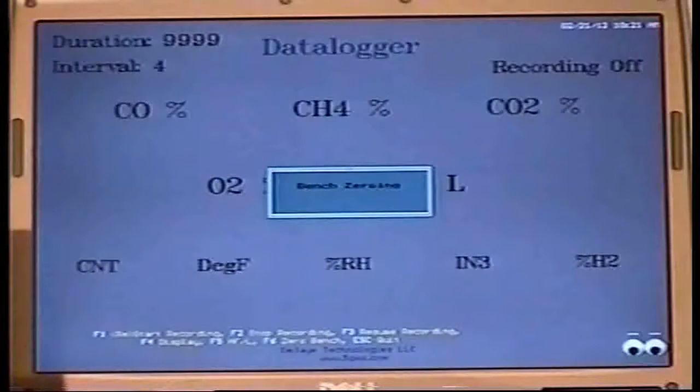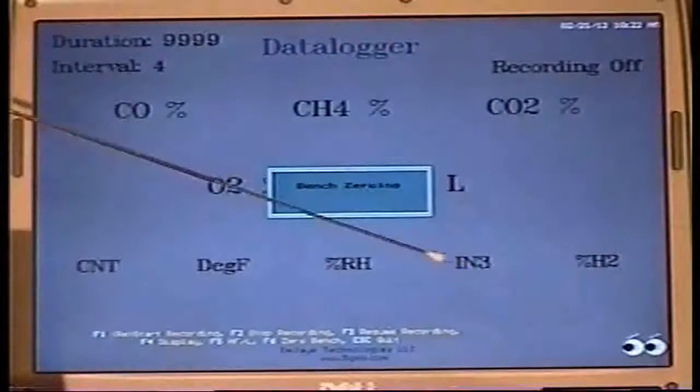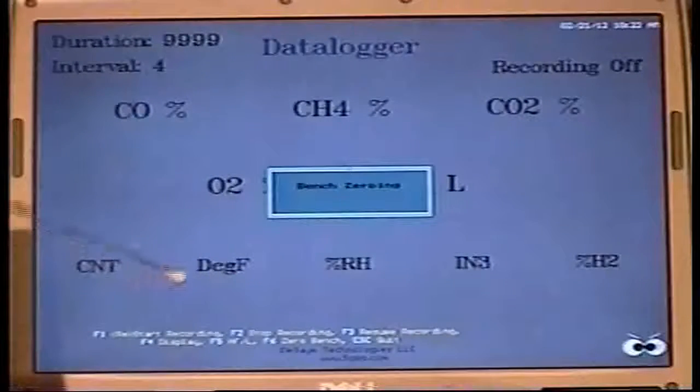We switched over to the gas analyzer screen. We have a flag where the analyzer is pumped and started. We're going to run fresh air through the sample chamber to start a reference. Also, while the thing is zeroing, across the bottom we have 5 entries. These are for the expansion ports.